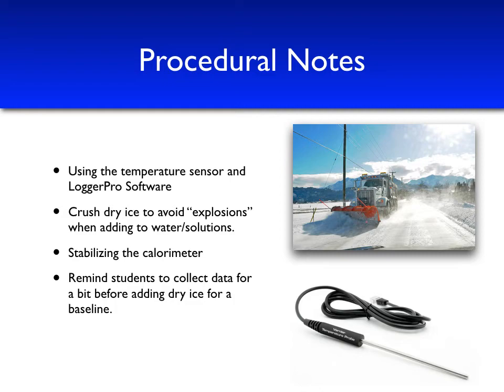In this experiment, we'll need to take our dry ice, which sometimes comes in larger chunks, and crush it up into almost a powder to avoid explosions that happen when water freezes around a large chunk of dry ice, creating a closed system, which can result in a pressure explosion. Therefore, we will crush the dry ice into a powder-like consistency.